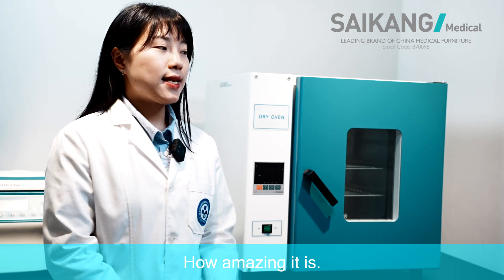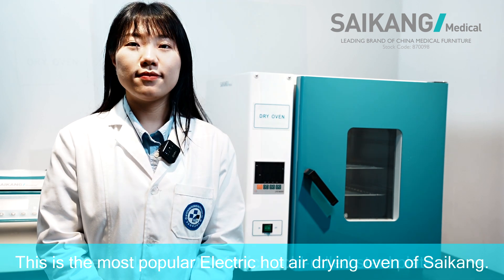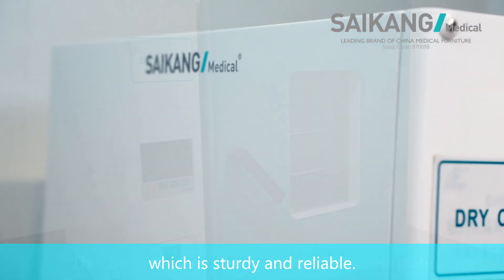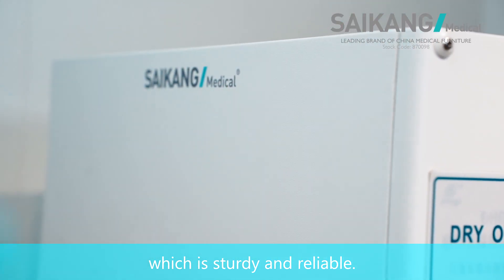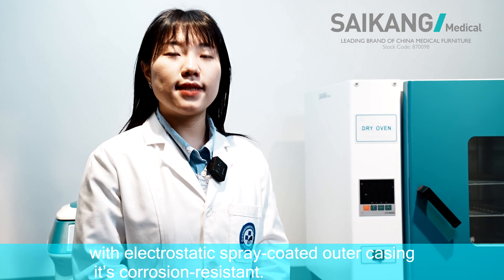How amazing it is! This is the most popular hot air dry oven of Saikang. The body is made of a thick cold-rolled steel plate, which is sturdy and reliable. With electrostatic spray-coated outer casing is corrosion-resistant.